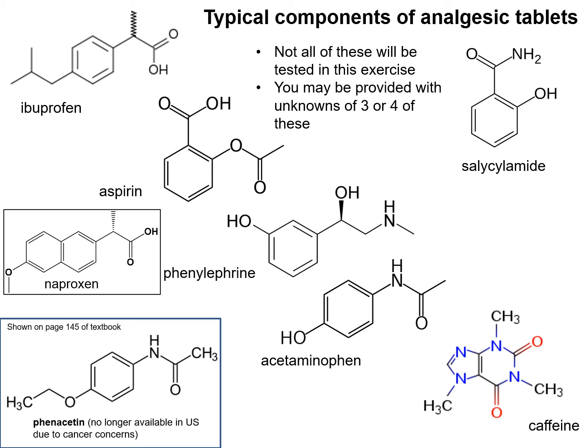In this experiment, we'll be using a mixture of analgesic tablets. These are painkiller tablets, which we use as a medical treatment.